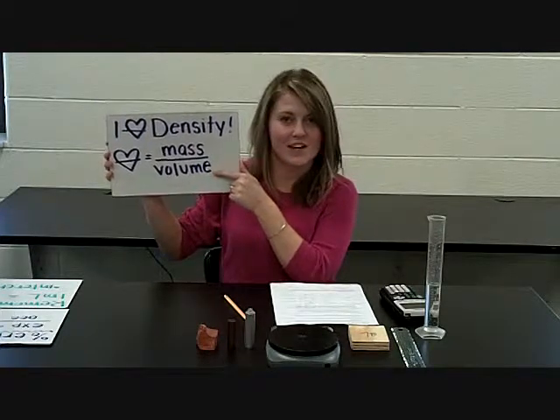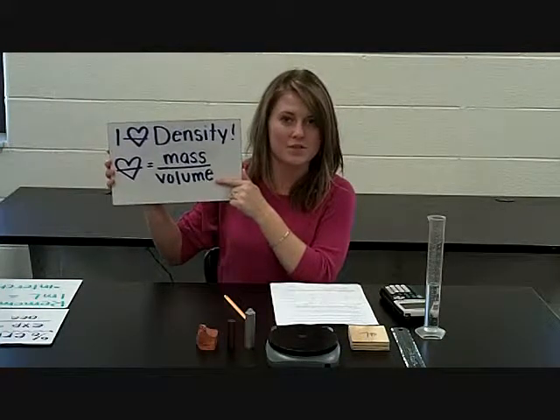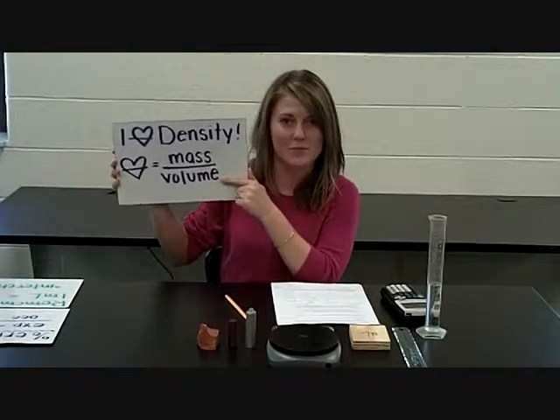If you did this correctly, water has a density of 1 gram per centimeter cubed, and all densities are based off of knowing that water is 1 gram per centimeter cubed.